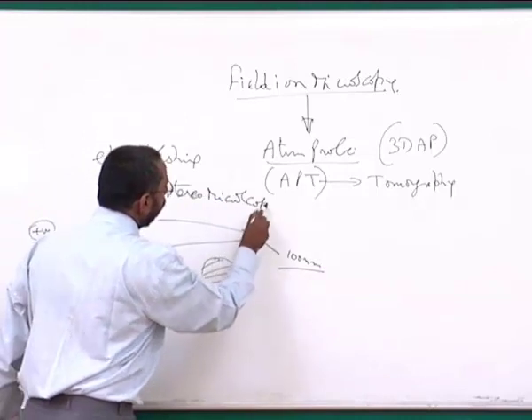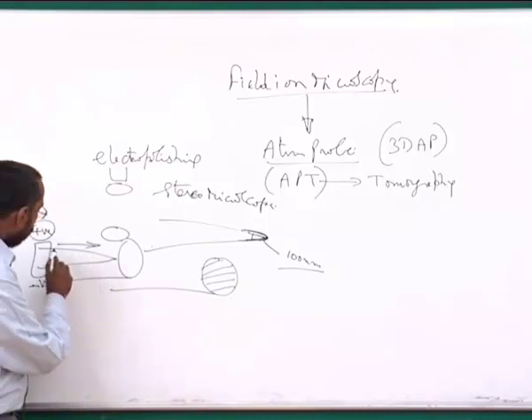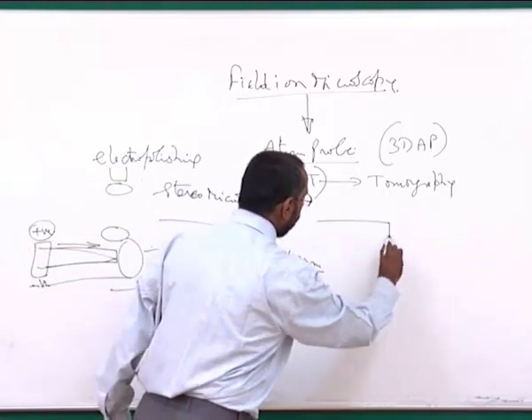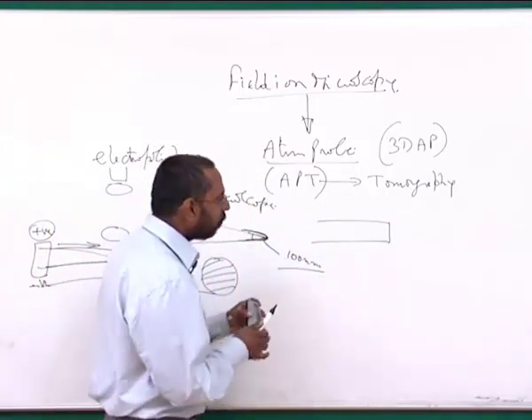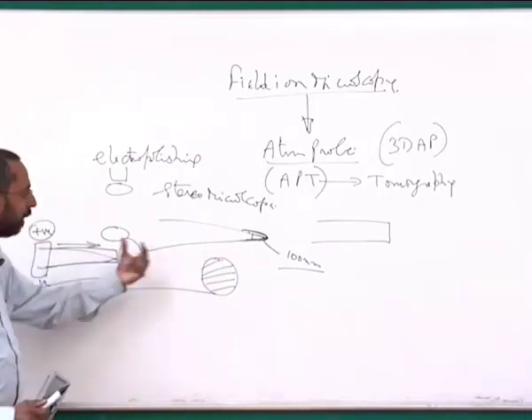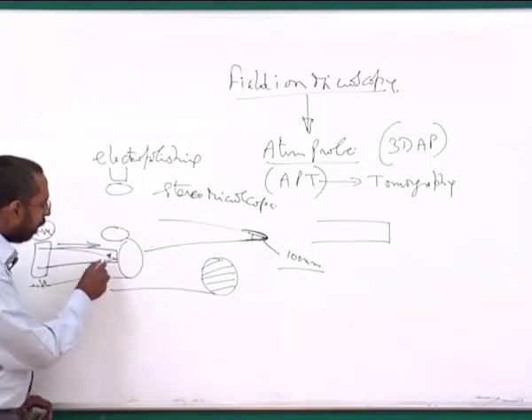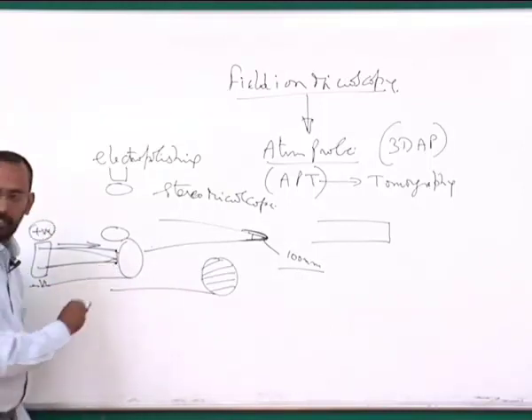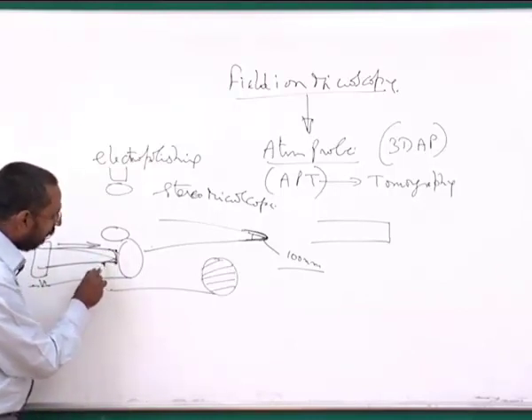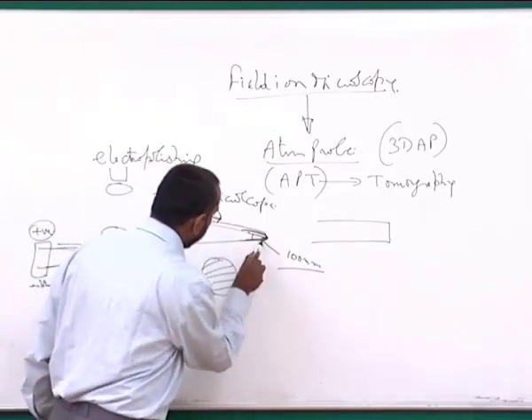That means you are trying to understand the 3D information of this. You might start with a rod of sample, and as this rod is put into the electrolyte again and again, as a function of time you will slowly see the tip forming, because whenever you take a rod, these regions are the high energy regions. The tips and the corners start getting blunted, and slowly the dissolution happens, and finally the sample becomes a tip like this.